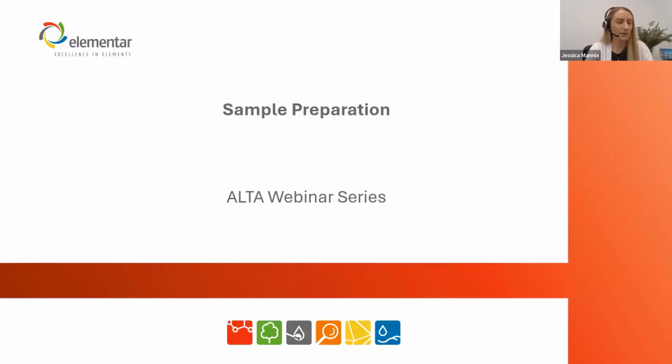Alrighty, I can't see the chat while I'm presenting. Well, hopefully we got some questions on the general parts of an analyzer, because now I'll transition more into the sample preparation side.